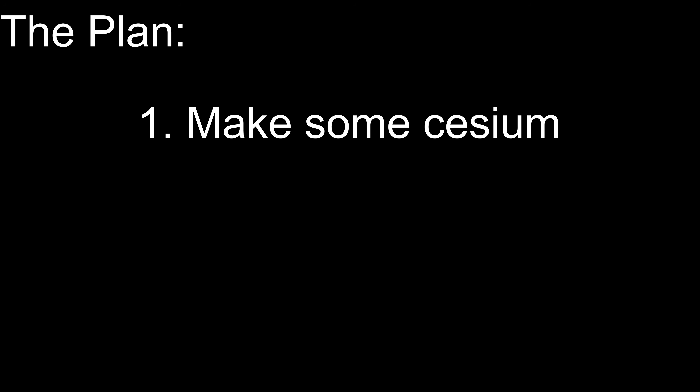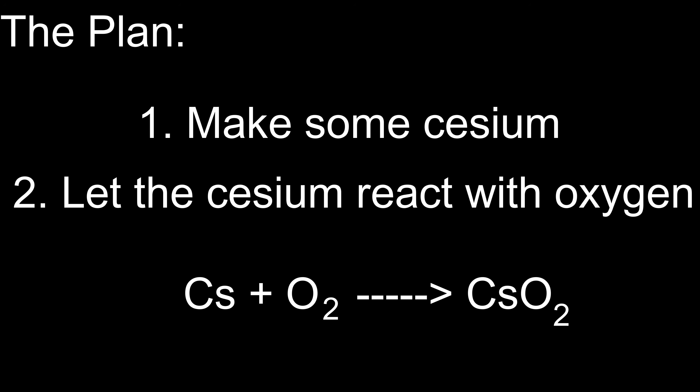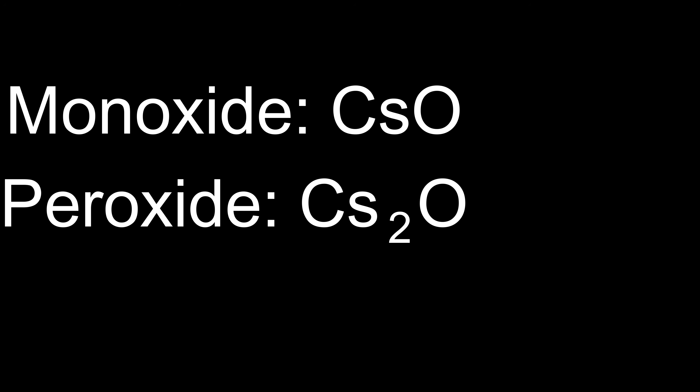Let's talk about the plan. First, I have to make some cesium by reducing cesium chloride with lithium. It's the same process I've used in my other videos. And in the second step, I have to let the cesium react with oxygen to form cesium superoxide. The challenge here is to only produce the superoxide. We don't want any monoxide, peroxide or any of the other oxides that cesium can form.